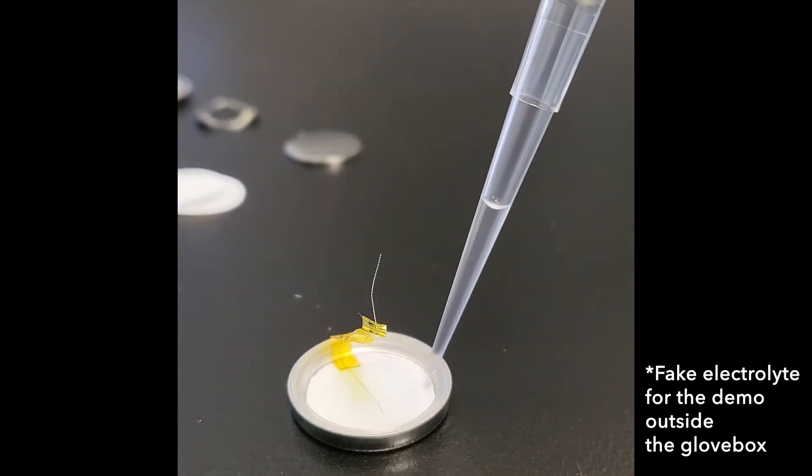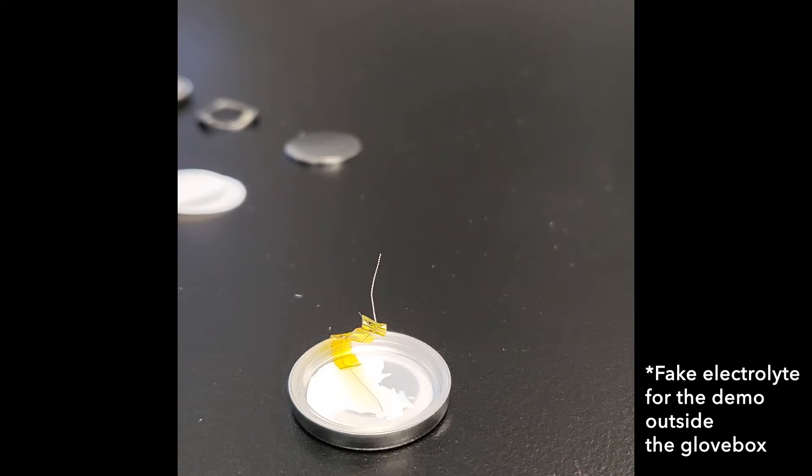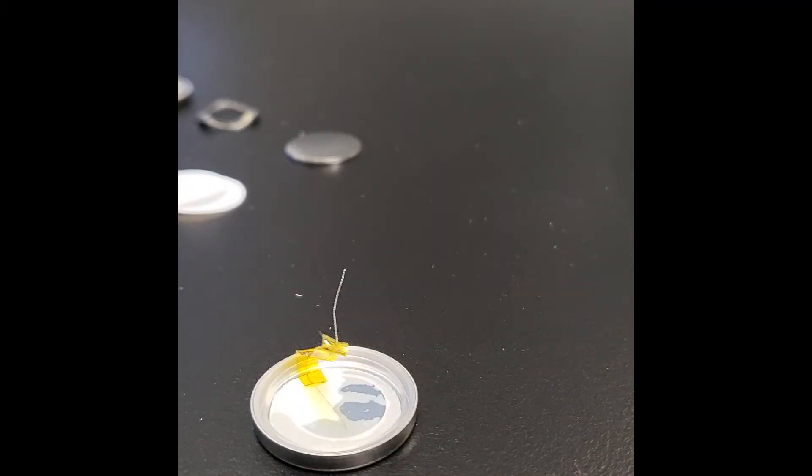Drop some electrolyte to wet the electrode and separator. This keeps those components in place while we proceed with the rest of the assembly. Keep in mind that the electrolyte will be continuously drying from now on. Ideally, you don't want to spend too much time from now on, otherwise you might change the salt concentration of your electrolyte.